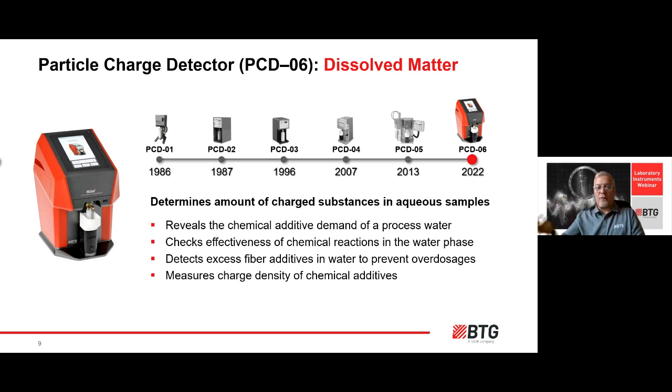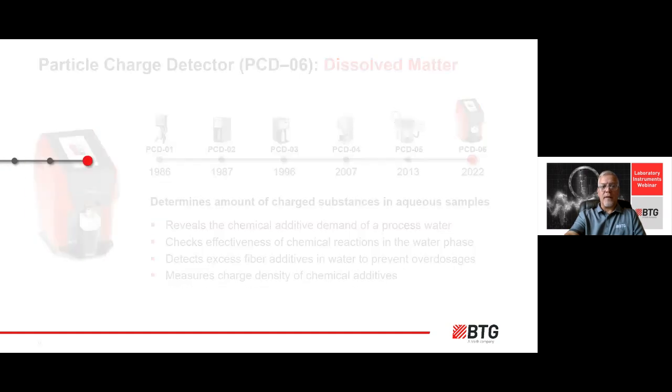It's going to help us understand what's floating around and working with the solids that are dissolved in your water stream, which makes up anywhere from 96 to 99.5% of your wet end water loop. That's why this measurement has become the dominant one in the industry to understand what's going on, because water is the thing. So now we know the PCD, the MUTEC, and its role and the measurement it's making.